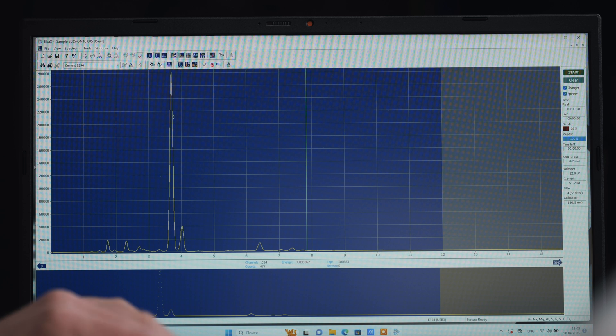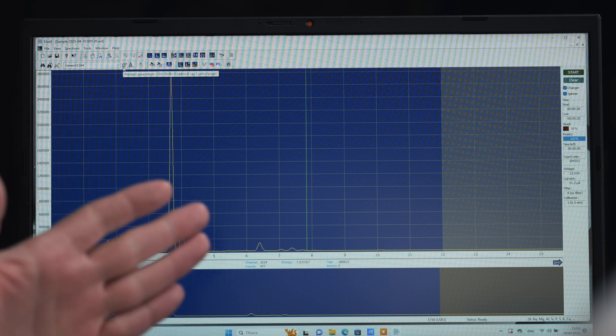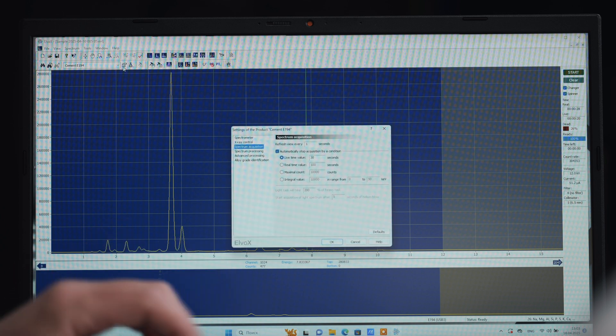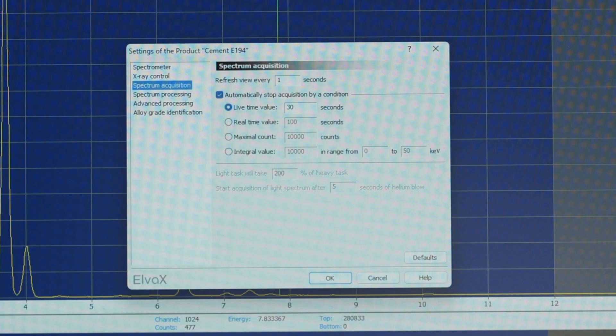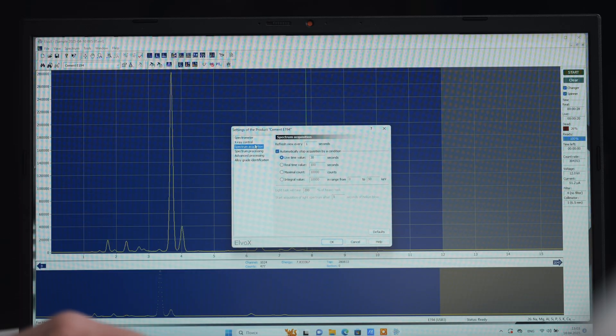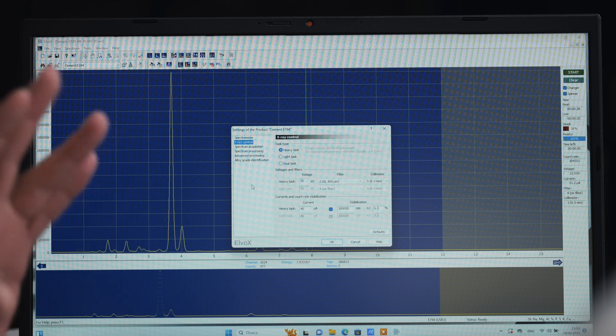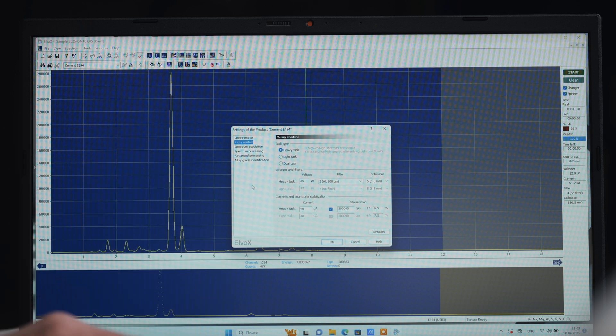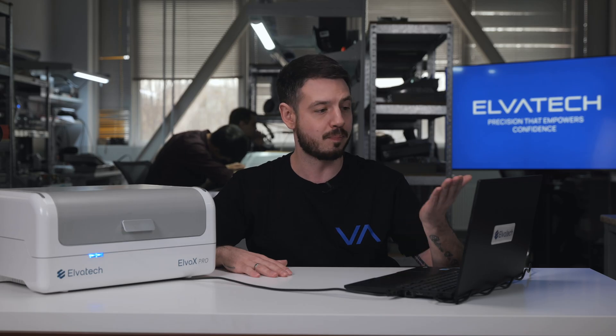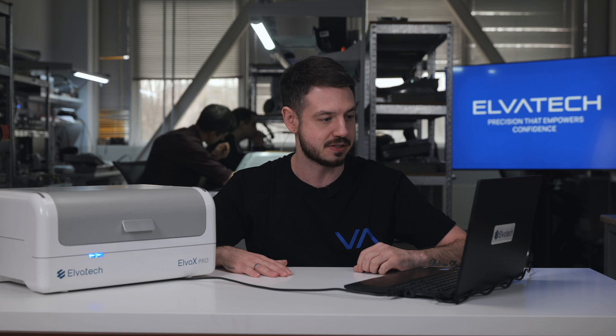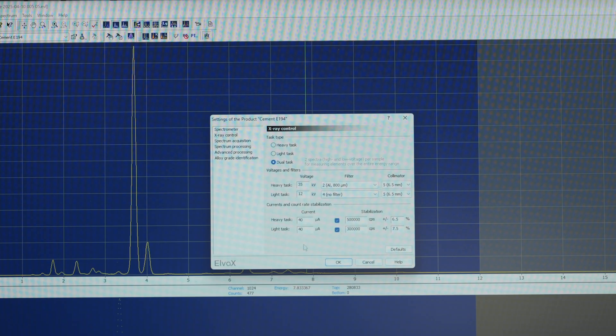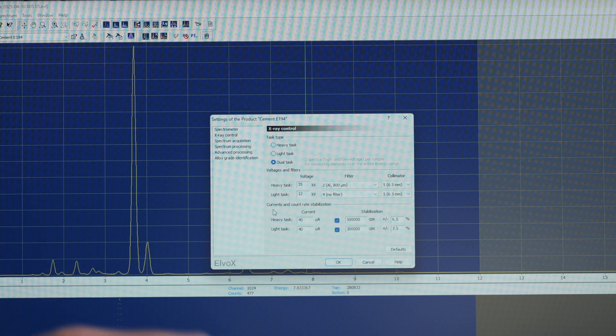First of all, we have to go to this section, which is called the product parameters. Here, we have to make some settings to improve our analysis. First, as we're going to measure here, we go to the section X-ray control. Here, we need to mark the dual task because we need to have all the passes for heavy and for light elements. As soon as we've done it, it provides us more options and gives us the current information of your tube.